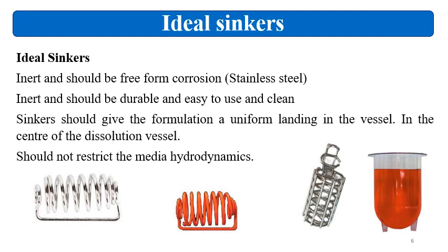Ideal sinker characteristics are these. It should be inert and free from corrosion. So generally it is made of stainless steel, and it should be durable and easy to clean. Then the sinker should give the formulation a uniform landing inside the vessel. So if sinkers are used and you are still getting variation, that means you may have selected a wrong sinker. So sinker evaluation should be done.